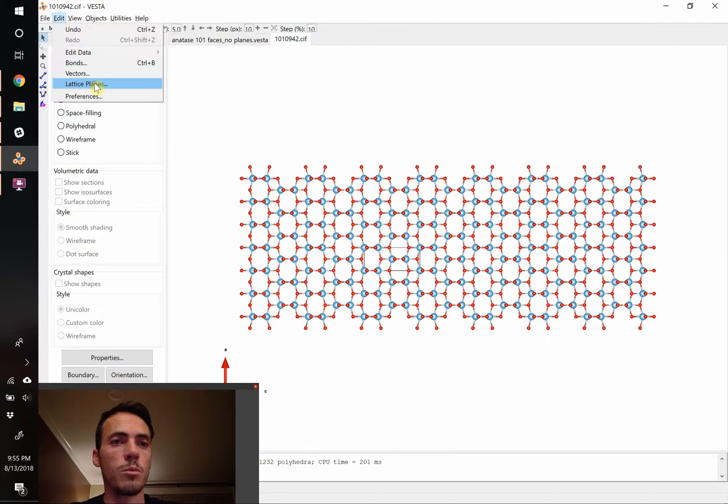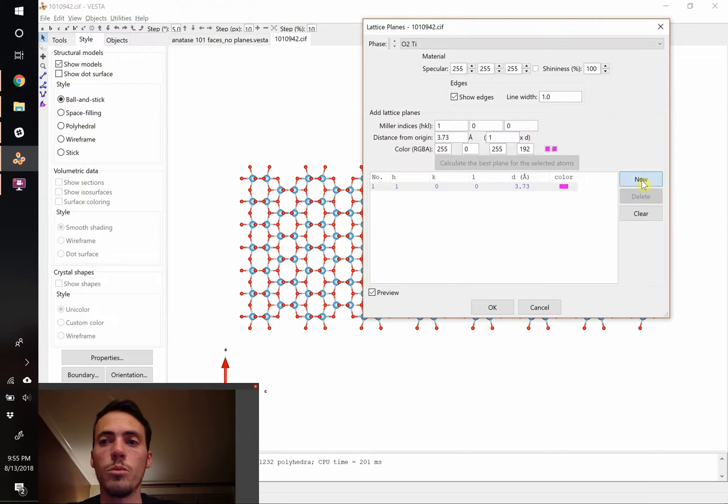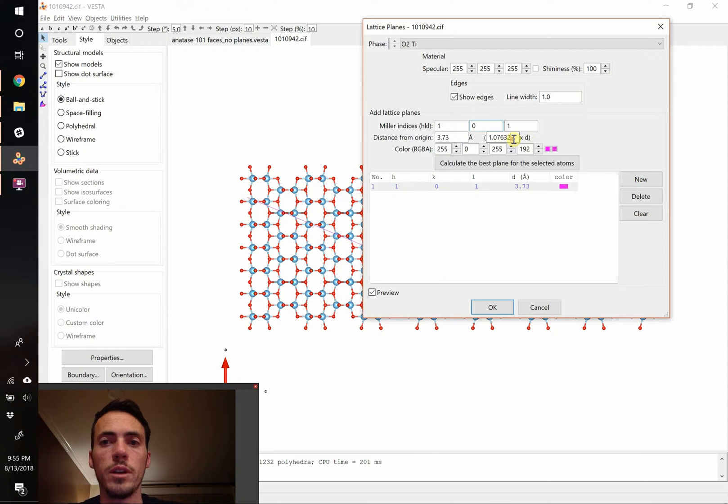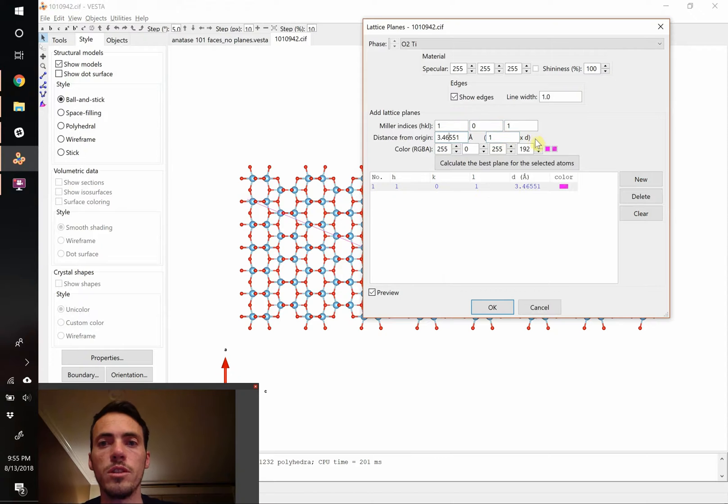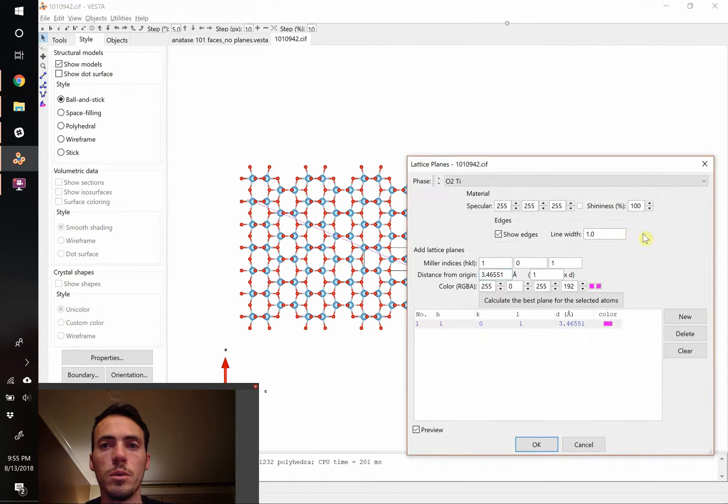So again, we're going to go to Edit, we're going to go to Lattice Planes, and we're going to enter the 1, 0, 1 family. So 1, 0, 1 family. Let's do integers of the D spacing, and have those go ahead and appear.